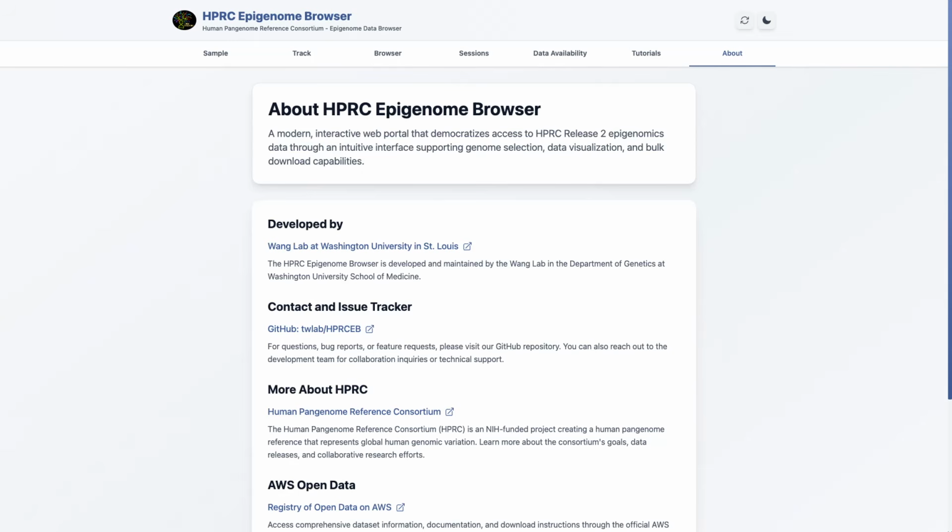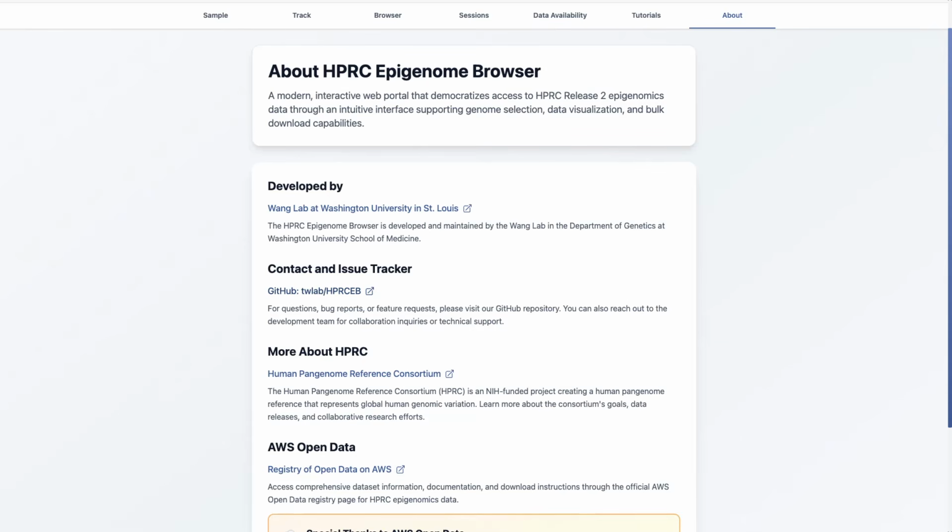If you encounter any issues, you can go to the GitHub issue tracker page and submit an issue here and let us know, and we will fix it.